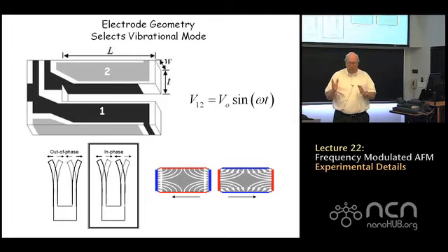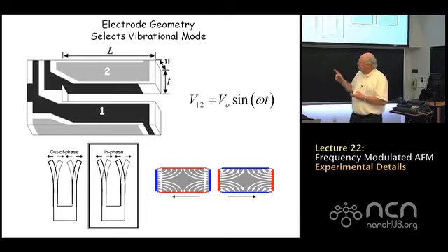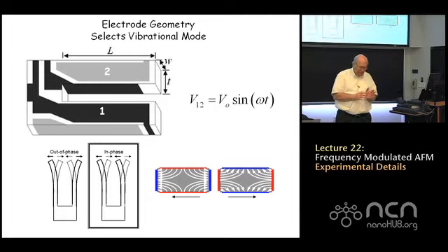And as I said earlier, the tuning forks that I like for AFM applications have been designed to produce this 2 to the 15th hertz oscillation, this 32 kilohertz oscillation. So the prediction is that if you apply a voltage at this 32 kilohertz frequency, this 2 to the 15th hertz frequency, then the tines of these tuning forks will oscillate back and forth with high amplitude, because you've reached the resonant frequency of this particular structure.